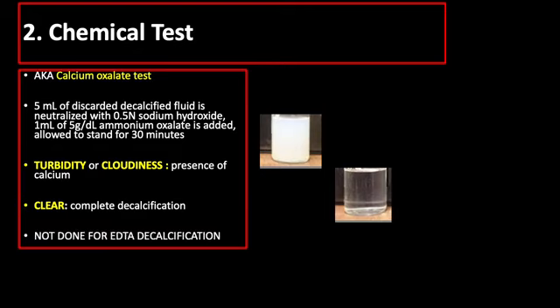So this test is not done if EDTA is used as decalcifying agent. So again, in chemical test, if there is turbidity or cloudiness, there is still presence of calcium, so decalcification is not yet done. But if it's already clear, so decalcification is already complete.